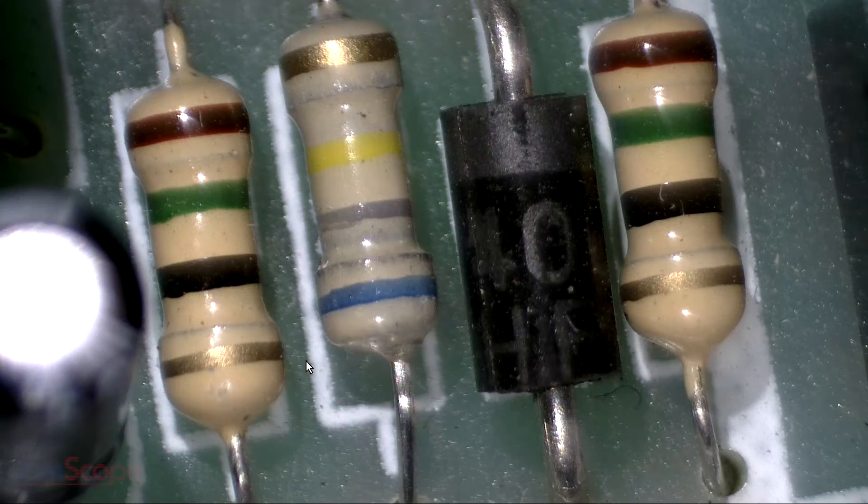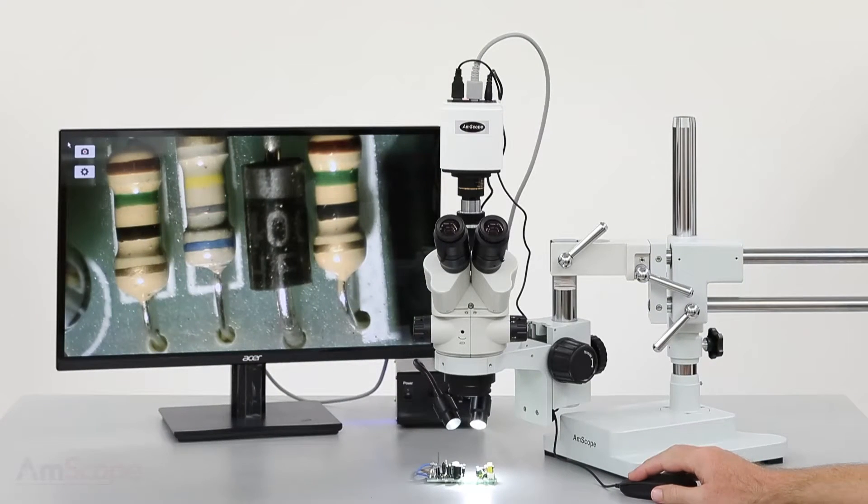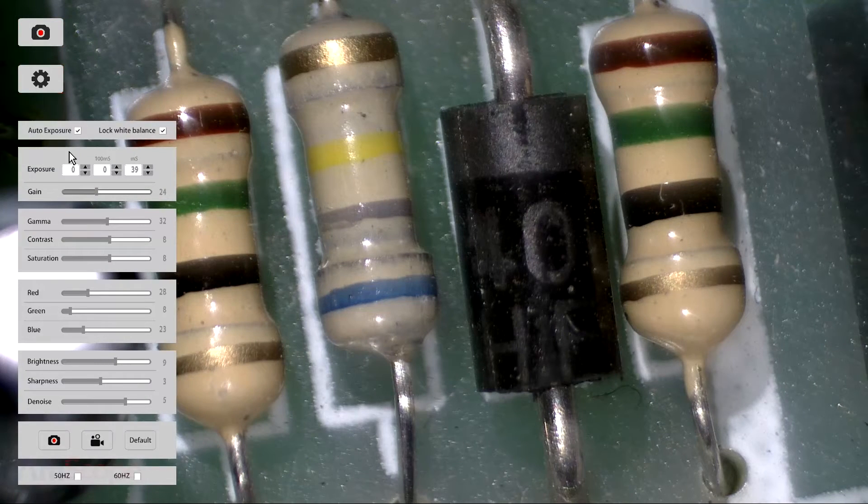When using the camera in standalone mode, all of the functions will be controlled using the mouse. Start by moving the cursor to the top left corner of the screen. This will activate the on-screen controls. The camera button will take a picture. The gear button will display the main control panel.